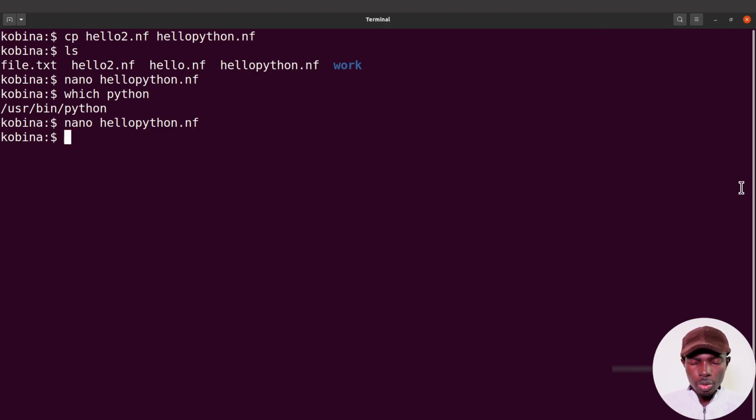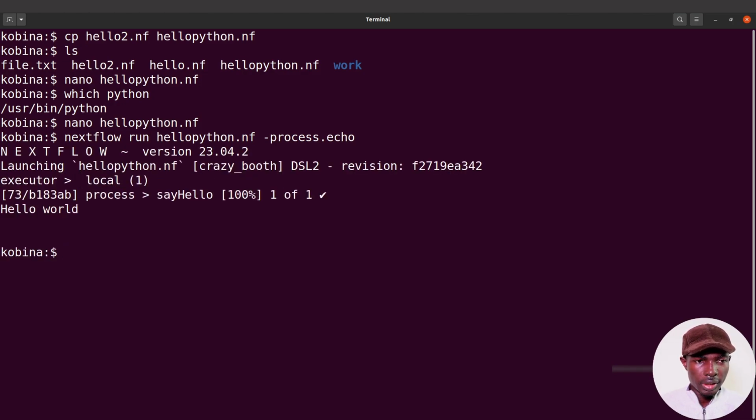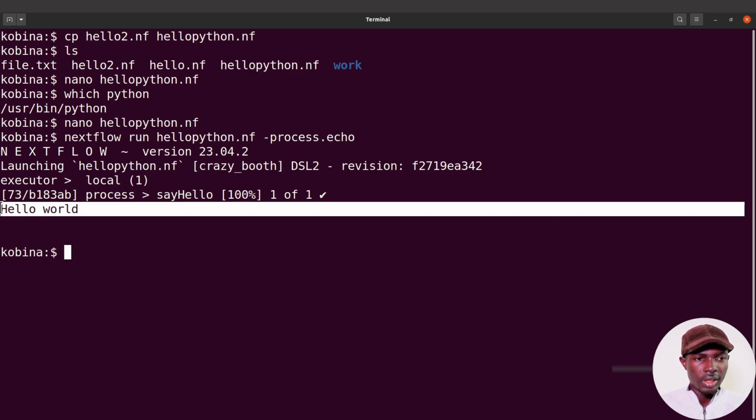So now I'm going to run Nextflow again. Nextflow run, this time it's hello python.nf, and then I'll execute it. So this will display it for us. So we have that here, hello world. All right. Okay, so that's how we do it.